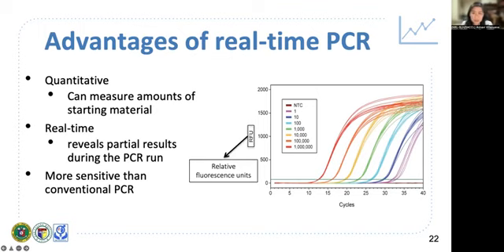So to your right is actually the graph that is presented to you in your real-time PCR. So this graph essentially is, ito, on your x-axis, the number of cycles during your run, and on your y-axis plotted is the relative fluorescence units, or the RFU, which is the fluorescence intensity scale. So gaano ka daming fluorescence yung na-emit ng fluorophore or ng reporter molecule mo, it will be reflected on your y-axis. And plotted are the amplification curves. So ito yung amplification curves of the samples and controls.